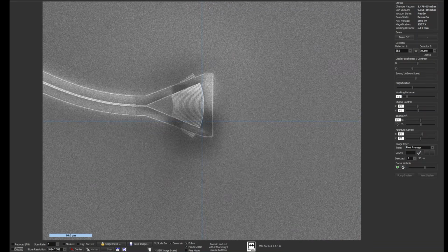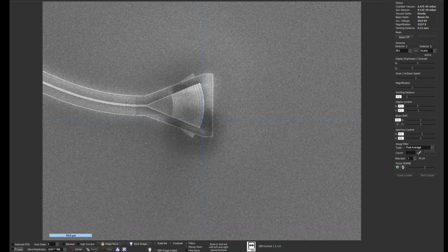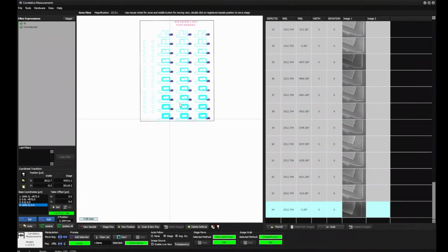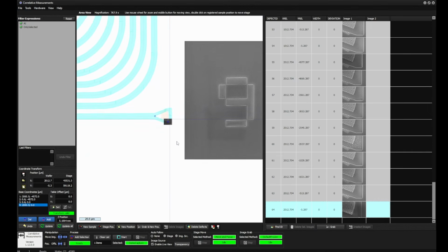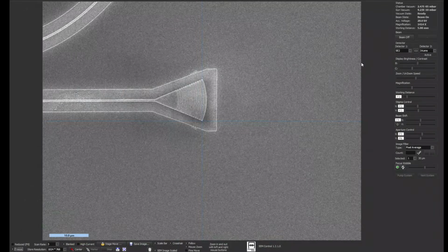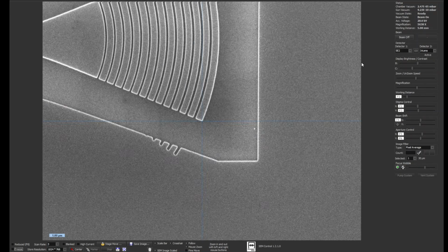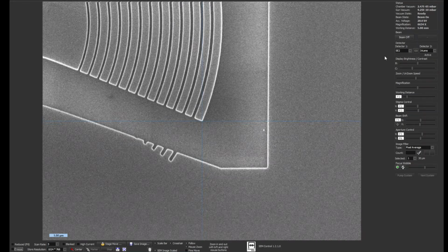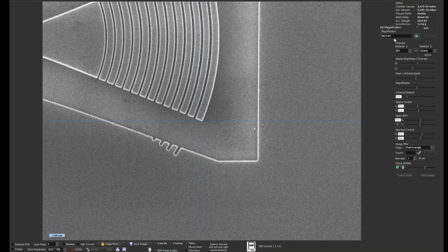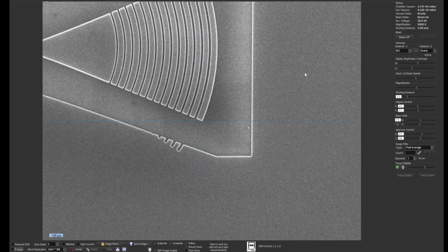Let us check how far we can go further. So maybe we could try to introduce another step with precision. So let's see how precise we can actually get with this procedure. And we do this by going to the SEM and choosing another magnification, for example, like this, or we can also set it directly to 5000x, like that.